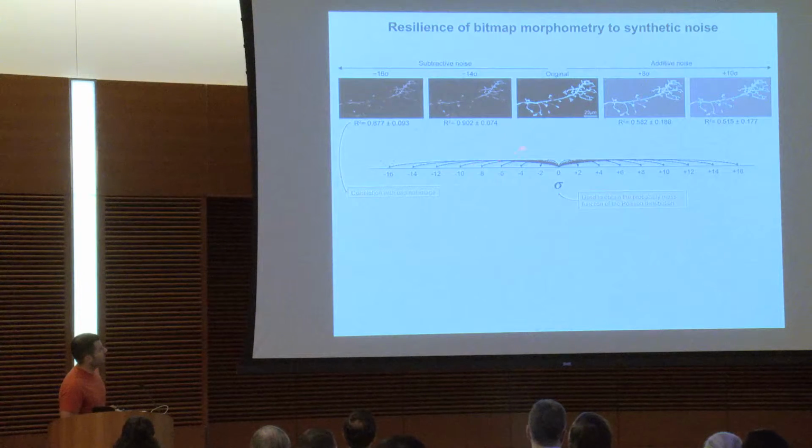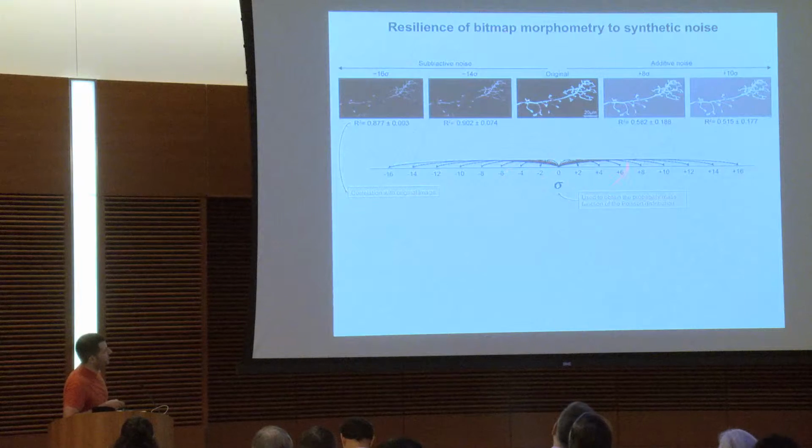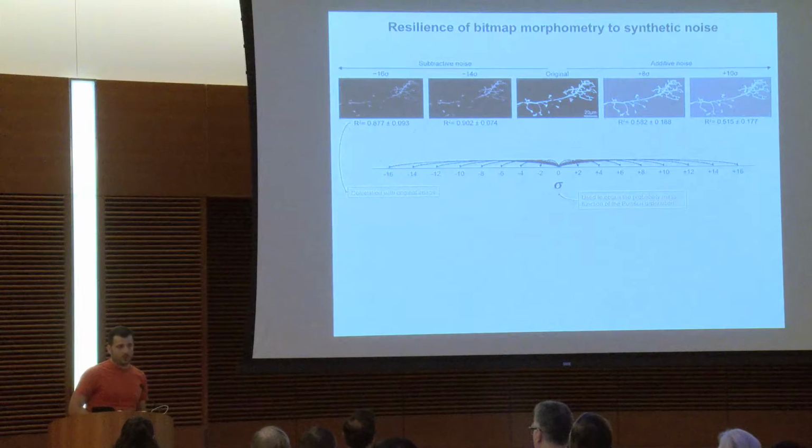Just to give you an idea of the data set that we picked, it is an axonal arbor from Drosophila, in this case labeled by a clonal technique called MARCM. This is how the original image looked. Then we performed iterative degradation, and we used the stack standard deviation as a probability mass function. You can see here increments of additive noise to the right, and negative noise to the left, which is perhaps relevant for multiphoton systems, associated with loss of signal there.